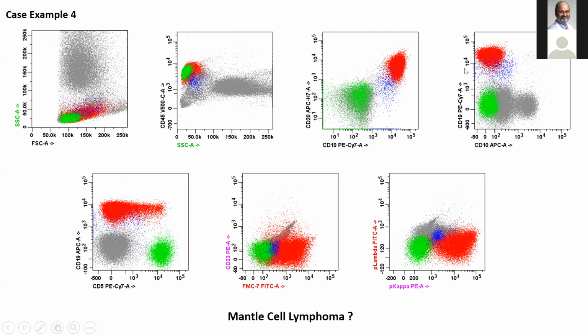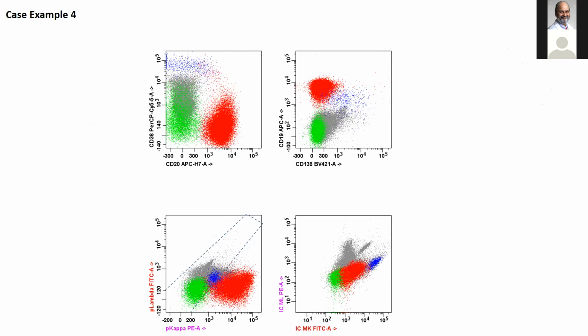Well, I would start to think, could these potentially be plasma cells? If this is a lymphoplasmacytic lymphoma, we know that that type of lymphoma is a B-lineage non-Hodgkin lymphoma that shows plasmacytic differentiation. So it's very typical to see plasma cells in lymphoplasmacytic lymphoma as part of your lymphoma. So let's just take a look then. Let's focus on the blue population.